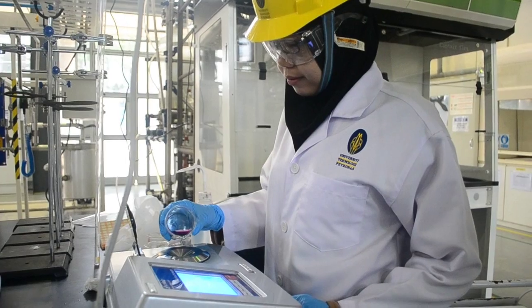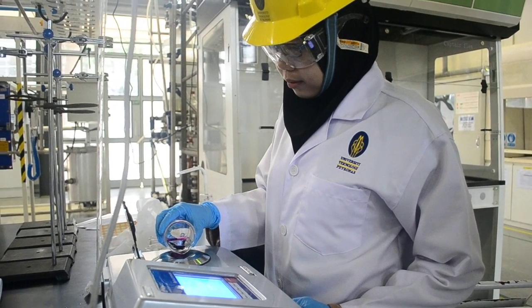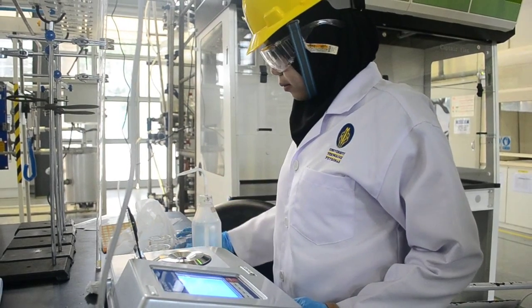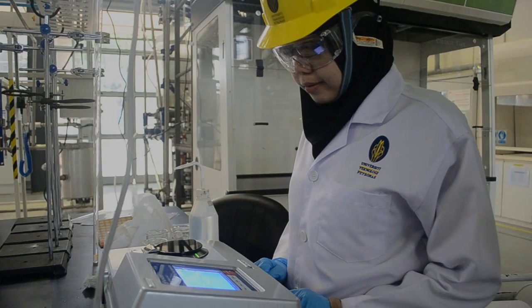For Part 1, the procedure is as follows. First, allow the flow of cooling water. Second, record the refractive index value of the feed stream. Then turn on the pump and set the level of potassium permanganate to 25 cm.